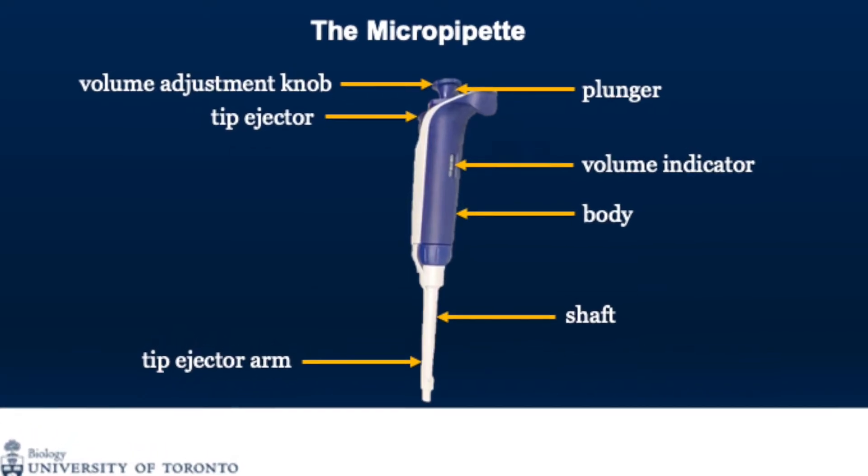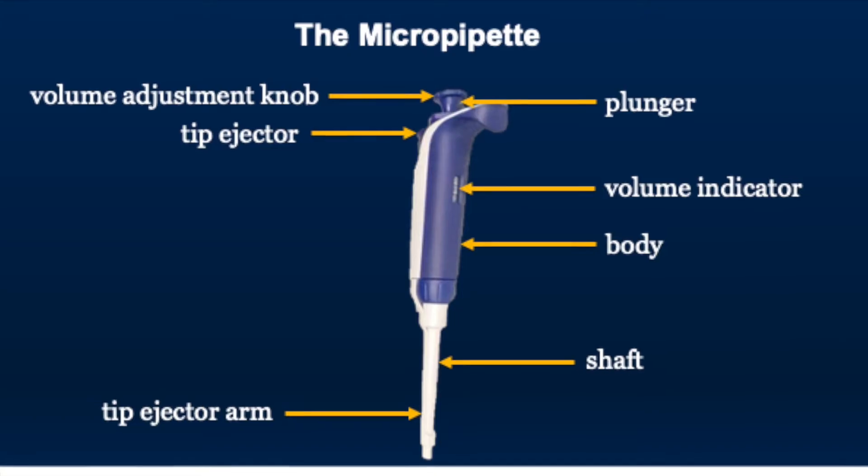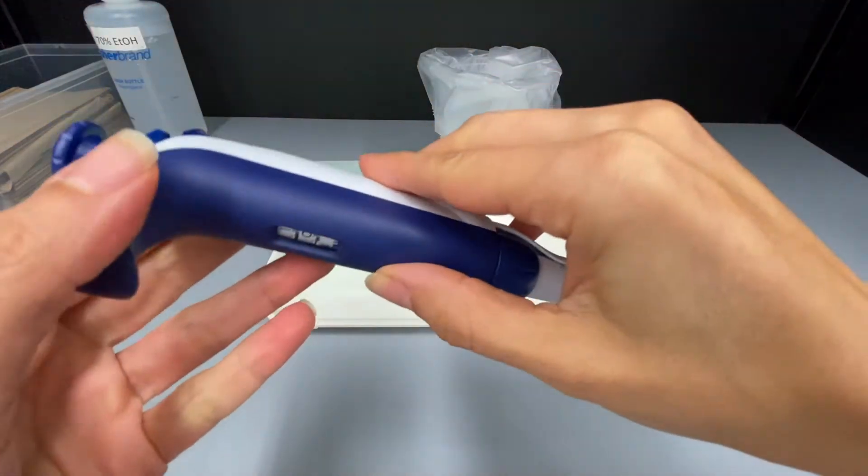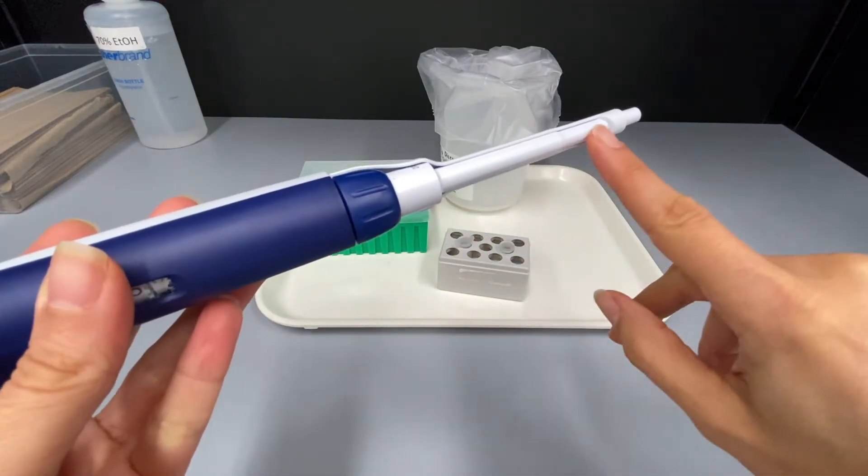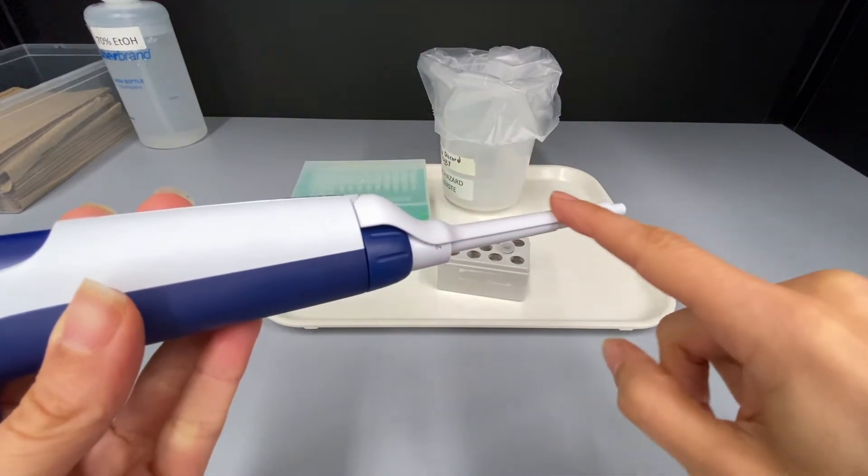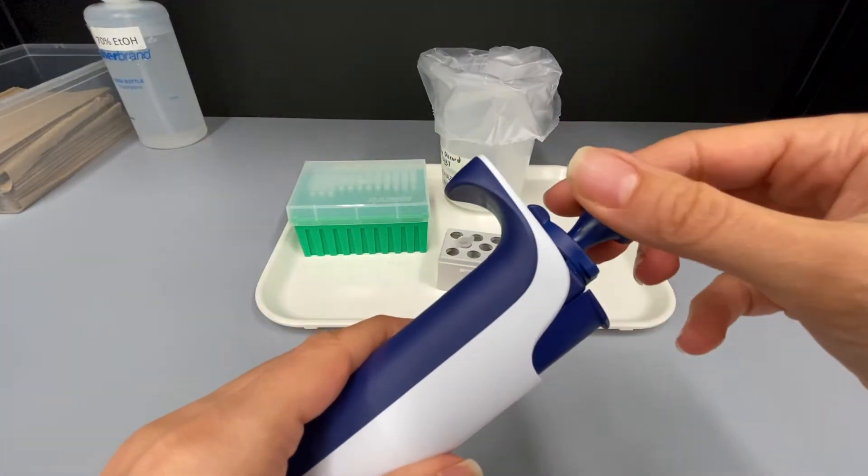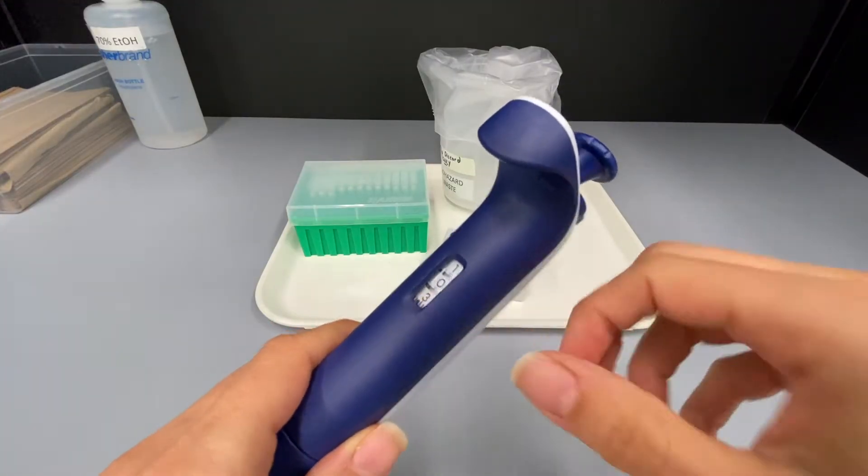Let's start by familiarizing ourselves with a micropipette. The micropipette consists of the body, the shaft, the tip ejector arm, the plunger, the volume adjustment knob, the volume indicator, and the tip ejector.